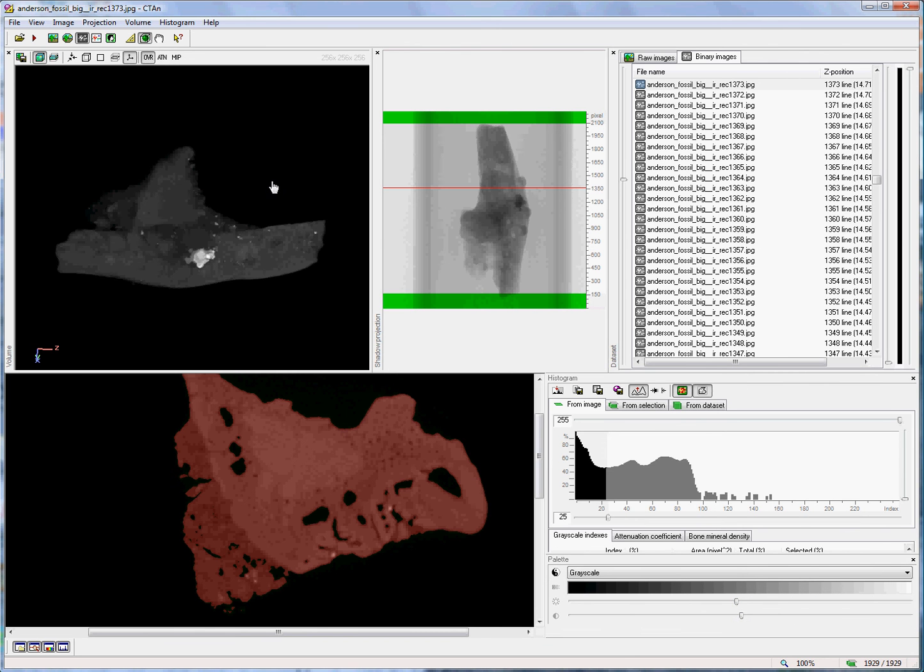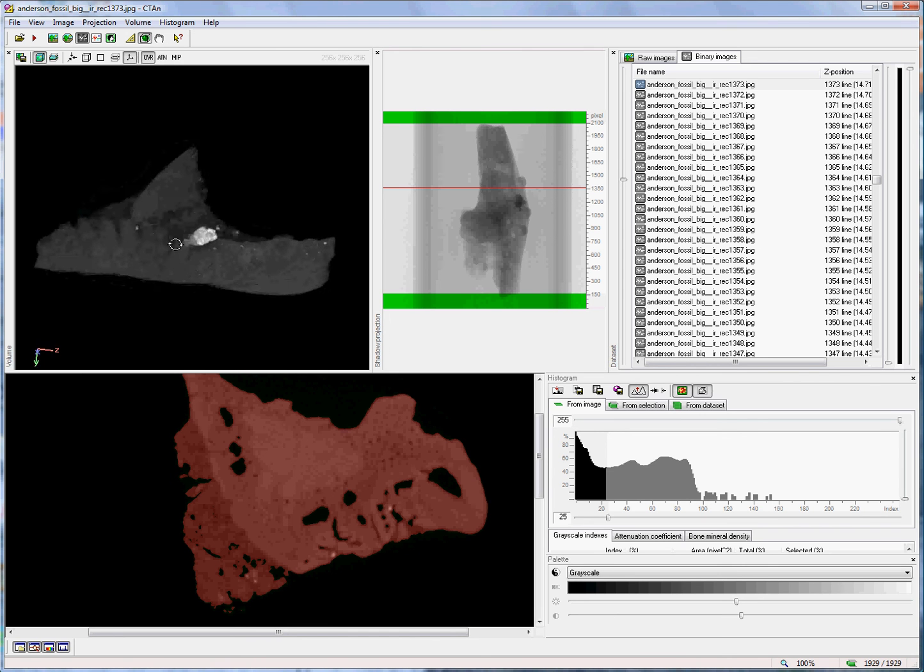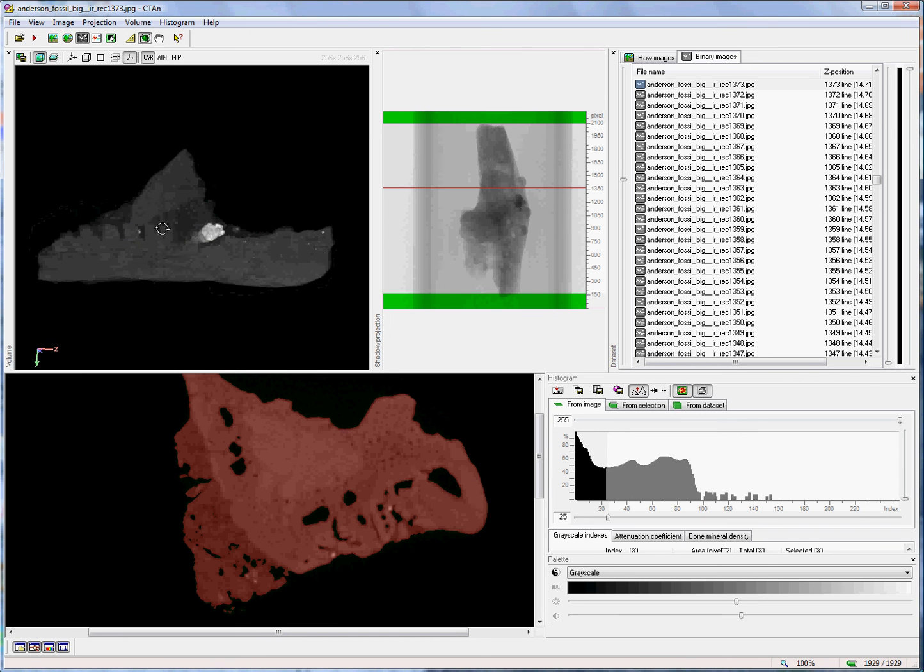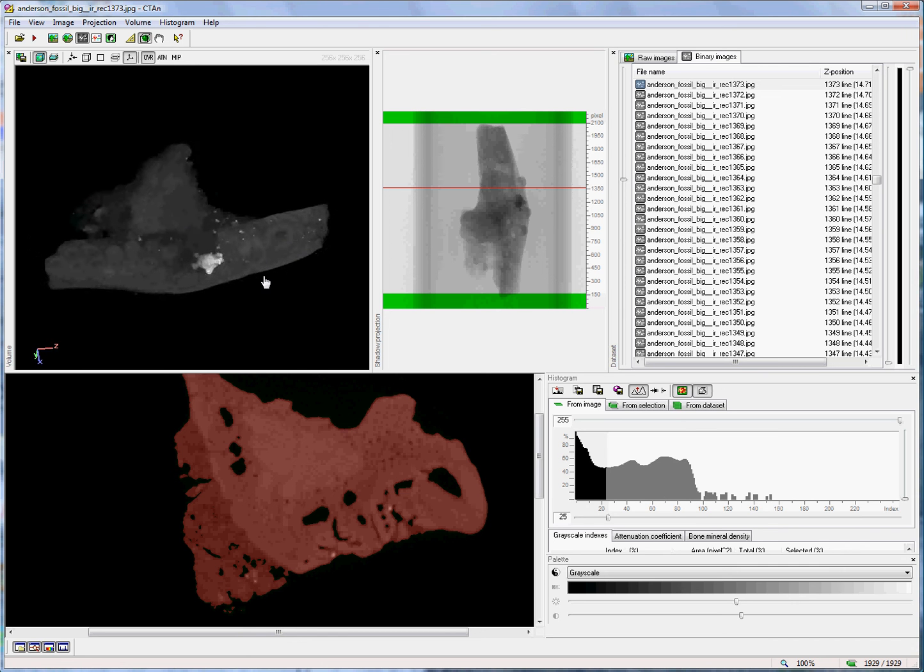Volume modelling is a new, real-time tool for rapid visualisation of the density and morphological characteristics of the open dataset in CT Analyzer. Thank you.